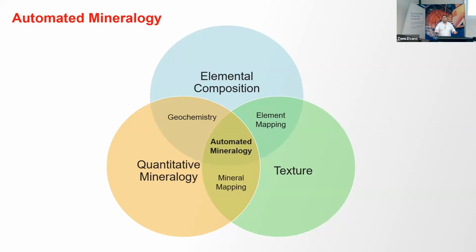There are different techniques that we could use, of course. There are fantastic techniques like ICP-MS, optical emission spectroscopy. We have XRF, we have LIBS. There are all these different techniques that would allow us to get the elemental quantification. There are other techniques that allow us to do the mineralogy, like XRD, for example.